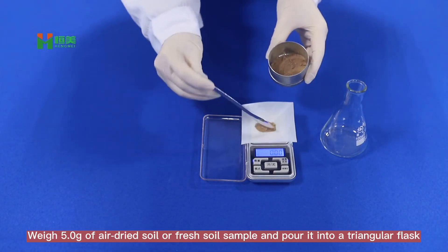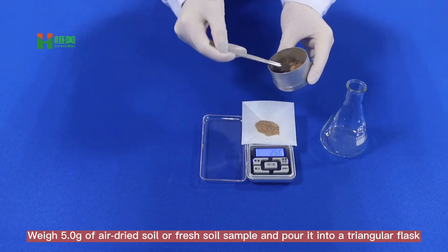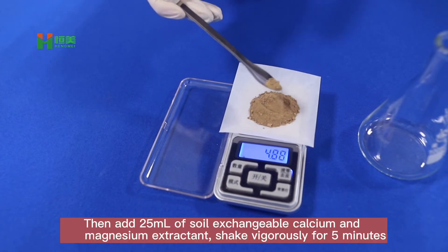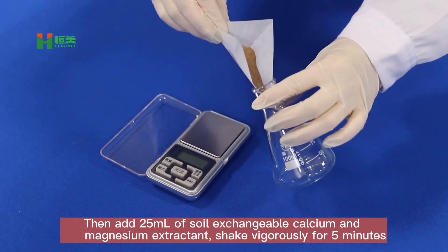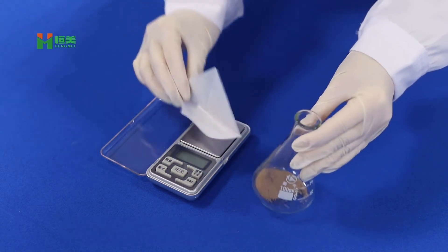With 5.0g of air-dried soil or fresh soil sample, pour it into a triangular flask. Then add 25ml of soil exchangeable calcium and magnesium extractant and shake vigorously for 5 minutes.